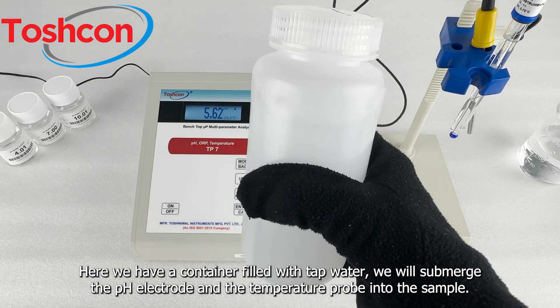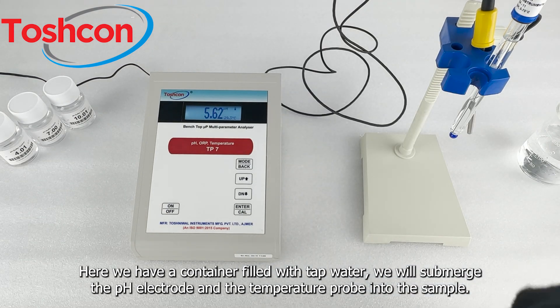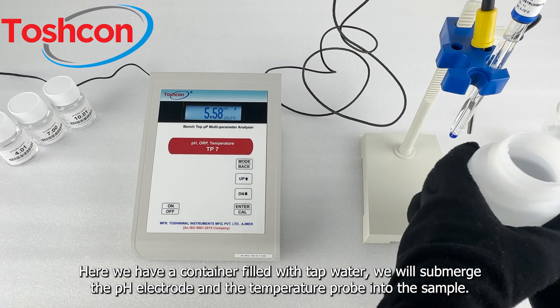Here we have a container filled with tap water. We will submerge the pH electrode and the temperature probe into the sample.